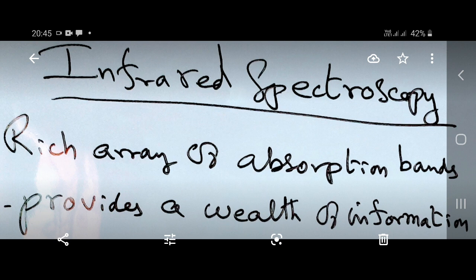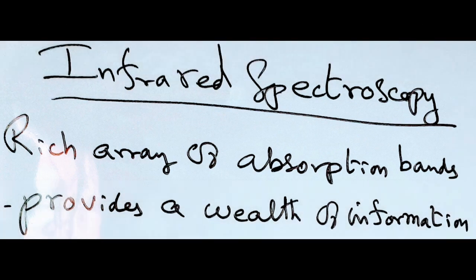See, infrared spectroscopy has a good number of absorptions. It shows a rich array of absorption bands when compared to UV visible spectroscopy.